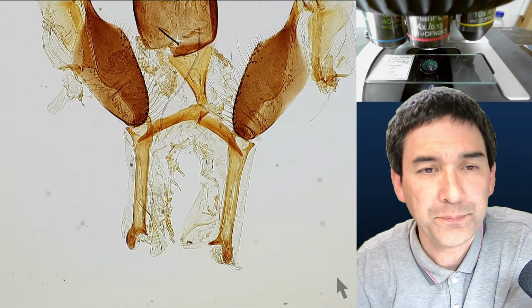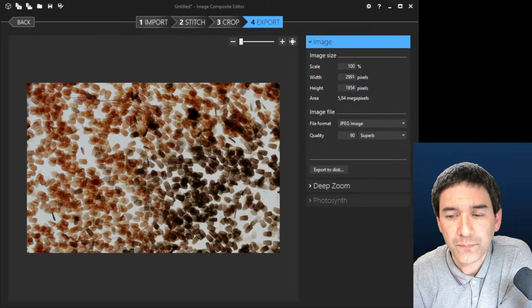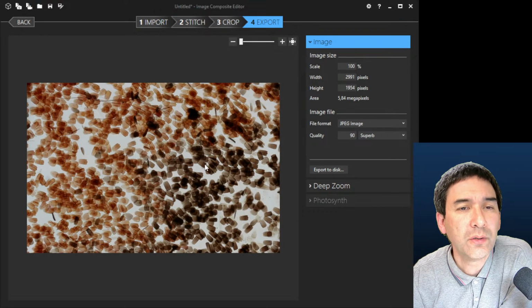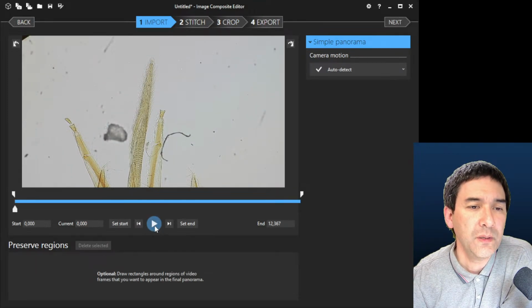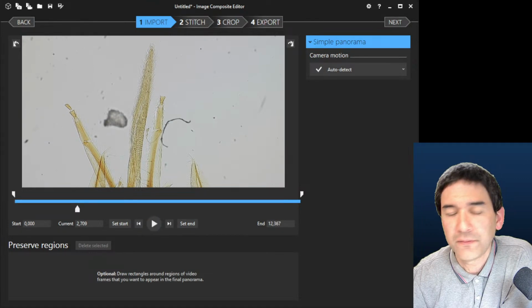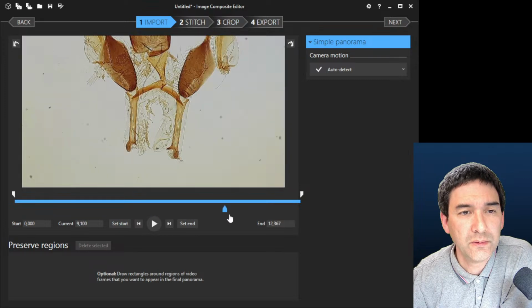And then we can go again to the Windows view. And let's try that. Discard. And I forgot, I think that's this one over here. Yes, it is. So this is the video that I made. That's how it looks.